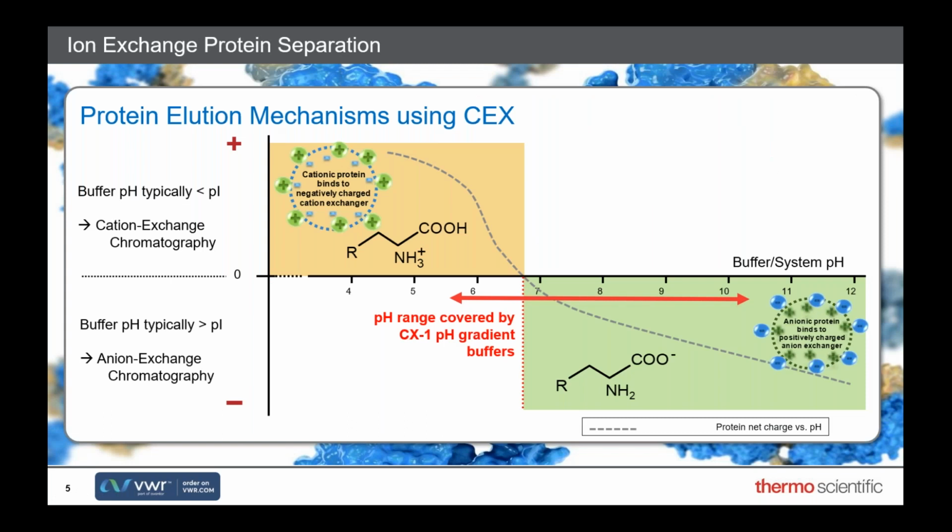So let's talk about what's happening in an ion exchange protein separation. Excuse the rather complex graph on your screen, but it's, to be honest, probably familiar to most of you in the audience anyway. And there are two general mechanisms to retain proteins on and to elute them from ion exchange columns. There's the more traditional salt gradient and what we're going to call the emerging pH gradient. I know it's been around for some time, but it's still not as widely used as salt gradient.